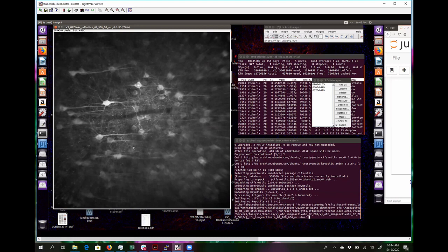The final conclusions are going to be, oh, region A has some however many neurons that are contributing to this particular behavior. That's probably going to be the standard systems neuroscience claim. That claim should be independent of your analysis methods. That is the ultimate qualifier for your data analysis pipeline.